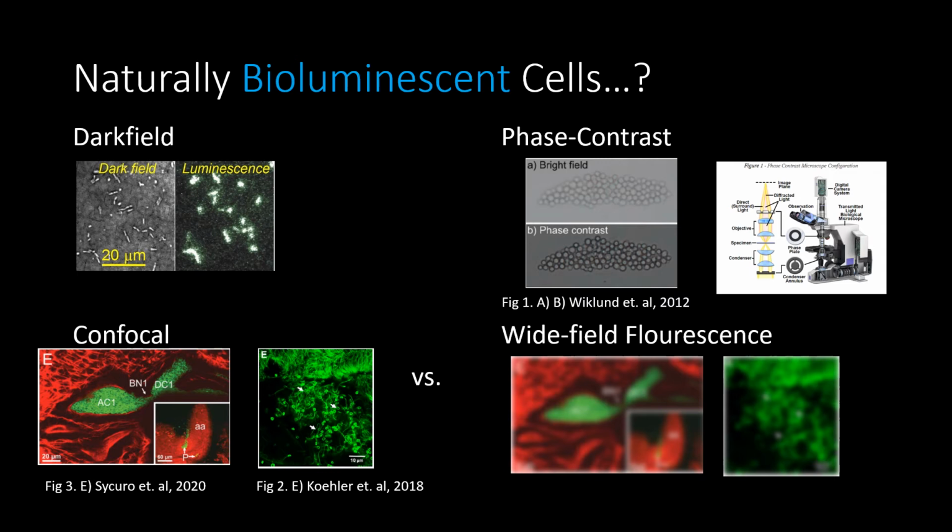Confocal microscopy reaches a resolution of 180 nanometers laterally and 500 nanometers down into the specimen, creating a wonderful 3D image. Fluorescence can be used well with confocal microscopy to highlight different parts of a cell. On the bottom left, a squid's light organ reveals its folded complexity and dynamic function in symbiosis.